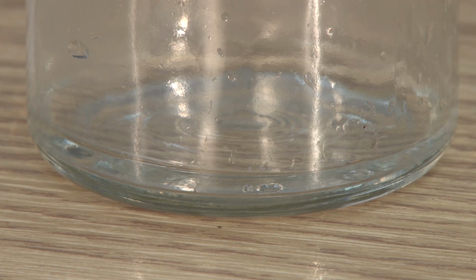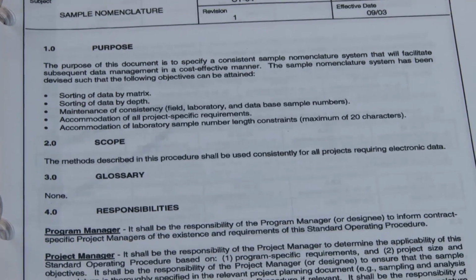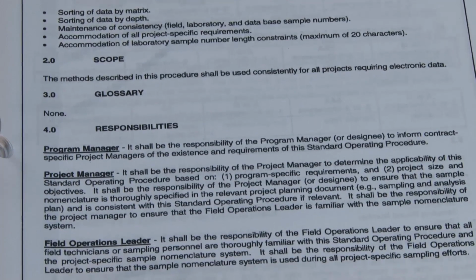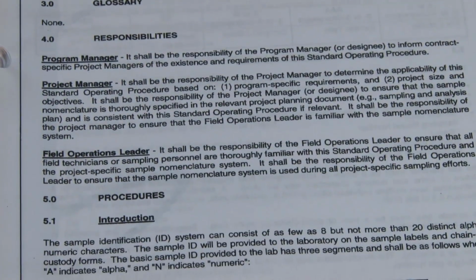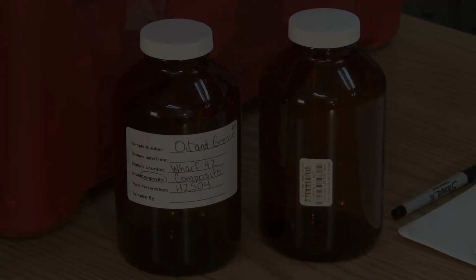Be careful to retain the full amount of the preservative in the container. Also, these preservatives are usually concentrated acids or other chemicals. Handle them carefully. Clearly label the container with the preservative type if you use any. If your SAP requires sending trip blanks to the laboratory in your cooler, do not open them. The laboratory uses them to determine sample contamination. Simply pack them with the collected samples for shipment to the laboratory.